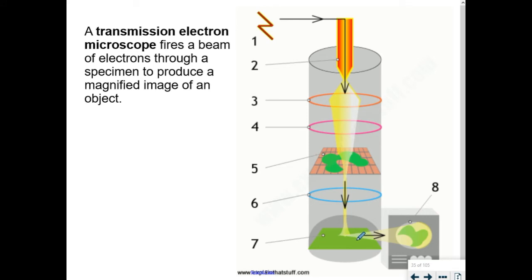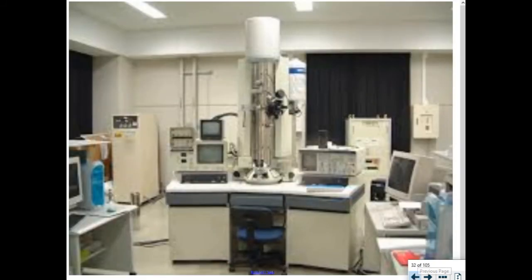There's not actually a picture that shows up here. This is why I like using Plato's cave analogy, because you're really just seeing shadows. This object right here that's in the way, the electrons are just phasing through it. You're just getting a picture of a computer code.